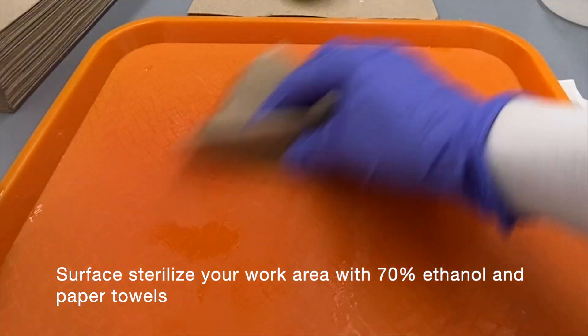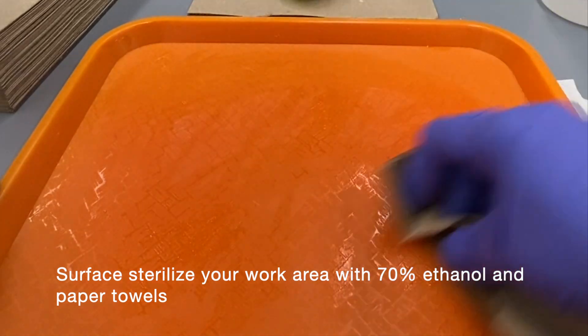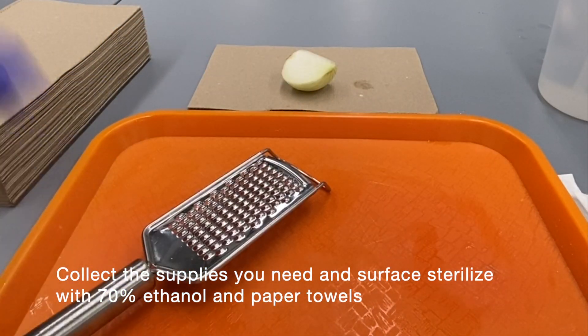Surface sterilize your work area with 70% ethanol and paper towels. Collect the supplies you will need and surface sterilize them with 70% ethanol and paper towels.